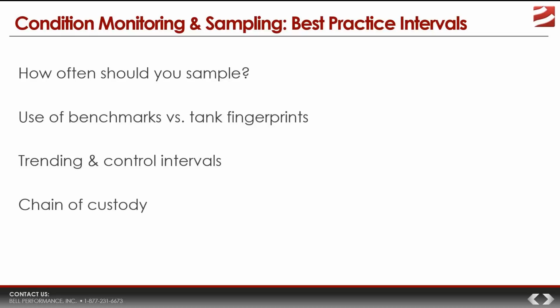Now, to break that down into a little bit more usable chunks, well, we would start by getting a good baseline, and then we would do trending, microbial trending over time to see how that baseline changes relative to time and whatever other conditions or parameters we wanted to use.